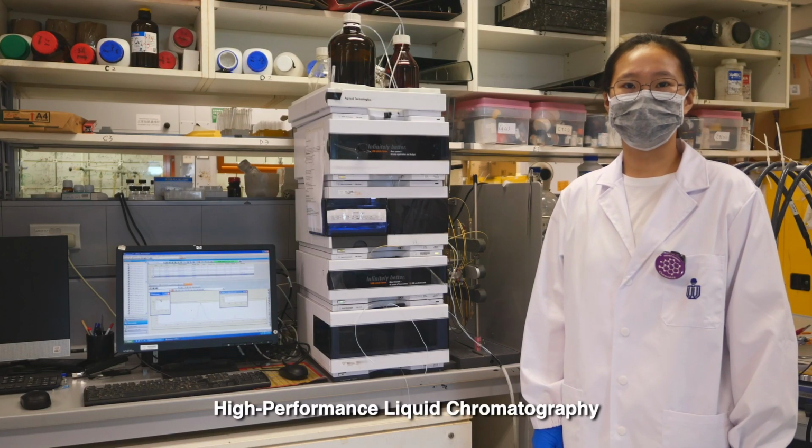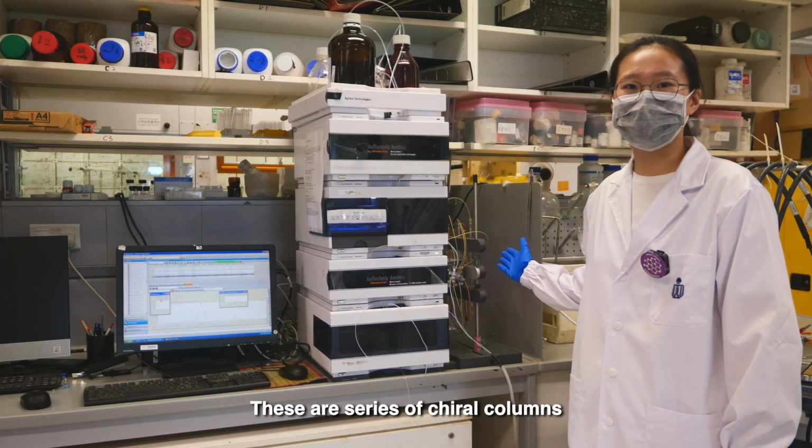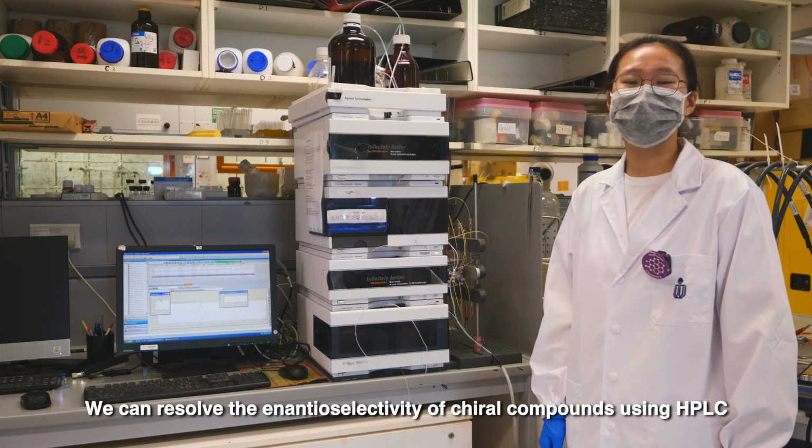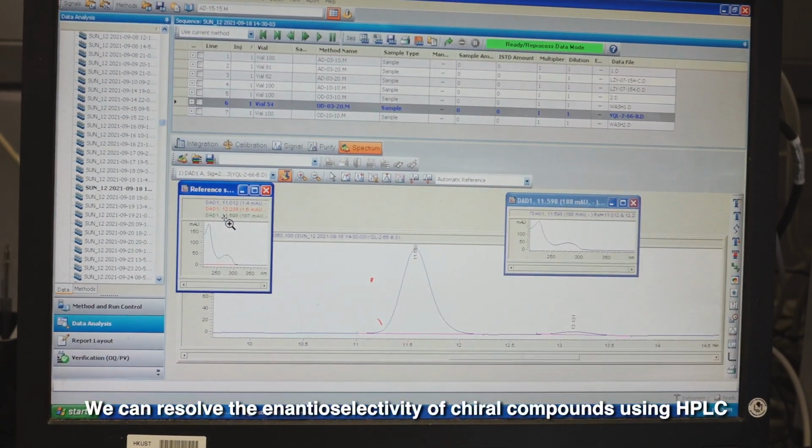High-performance liquid chromatography is another common technique used for separation. These are a series of chiral columns. We can resolve the enantiomer selectivity of chiral compounds using HPLC.